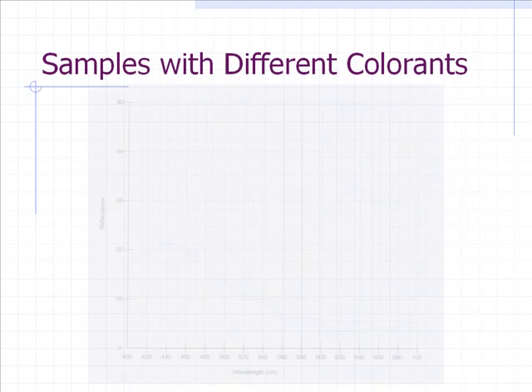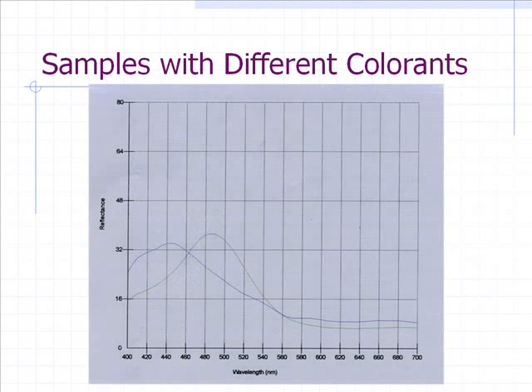Now this set of curves here would both be, what color would you say that would be? Now that you're curve experts. You guys are, yeah, bluish green. Would it be very chromatic or not? No, because there's not a big difference, it's not way up there, it's just kind of flat.